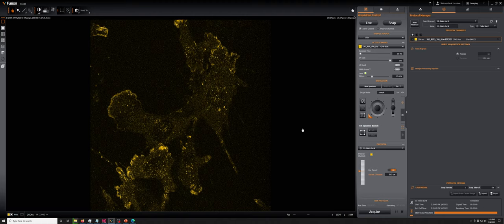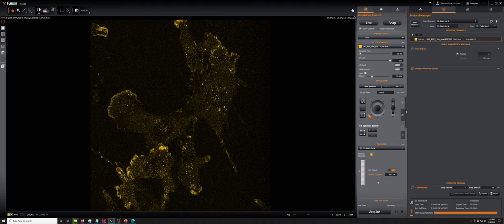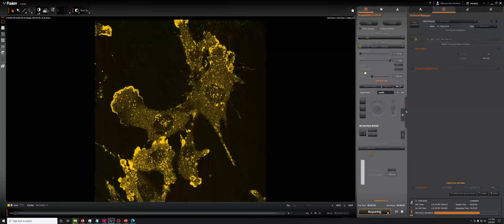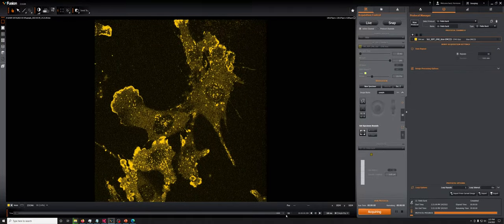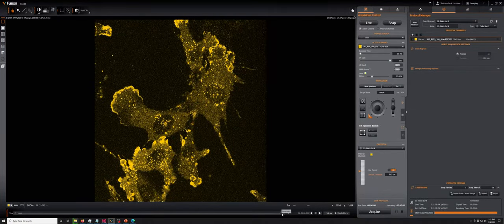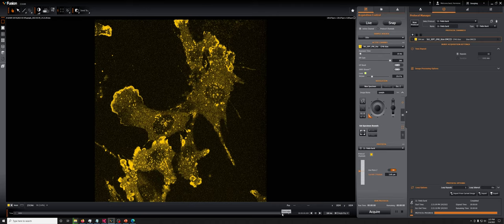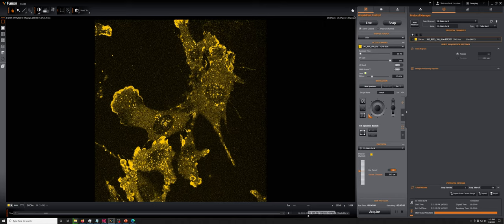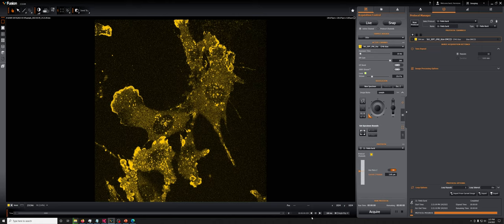Okay, so let's say we have this sort of 10 millisecond exposure that we want. And we want to go as close to that as possible. So what are our options? So let's kind of see what our starting point is. So if we're in finite burst, we're at 30 megahertz. Let me just acquire 11 frames here and see how much extra time there was. So you can see that between the first and the second frame, if everything had gone as fast as possible, we would have had a 10 millisecond interval. Instead, we had 39. So there's sort of 29 extra milliseconds that we need to try and reduce. And so what are our options for reducing that?